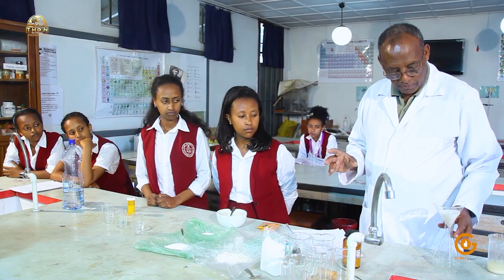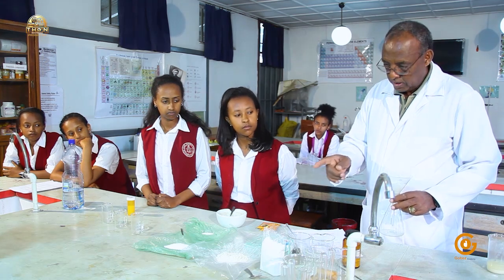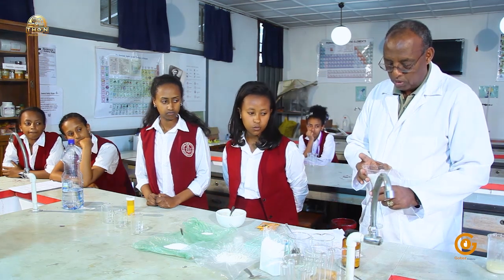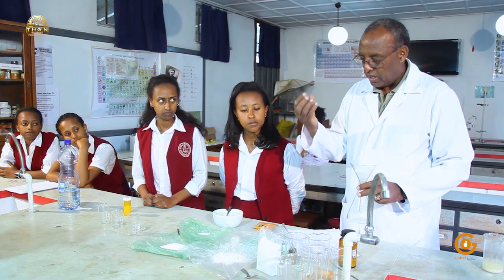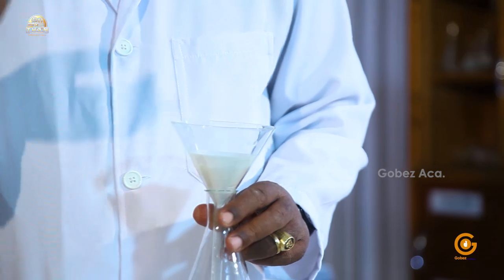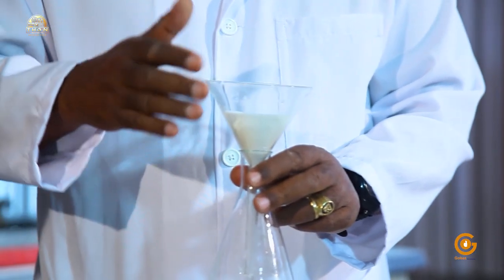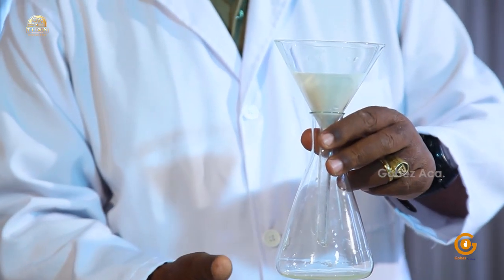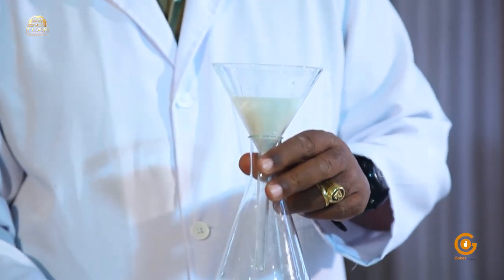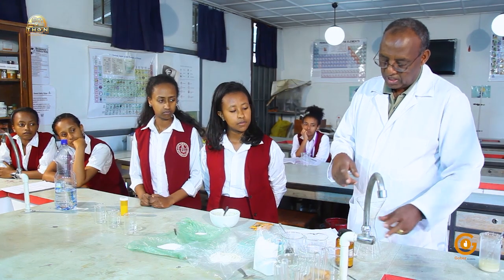Over here you have a glass where the ground wheat has been dissolved in water, because the wheat has husk, which is mainly cellulose, that is water insoluble, and I'm trying to filter to get something richer in the starch, which is water soluble, more soluble than the cellulose.